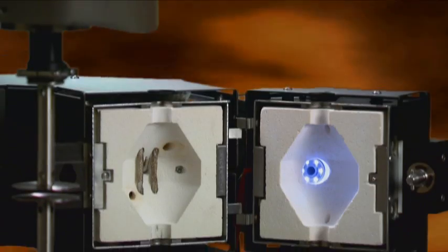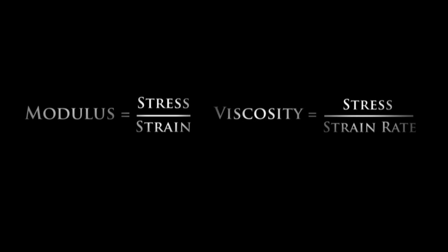The rheological behavior of materials is described by material properties such as the modulus or viscosity. Modulus is the ratio of stress to strain. Viscosity is the ratio of stress to strain rate.